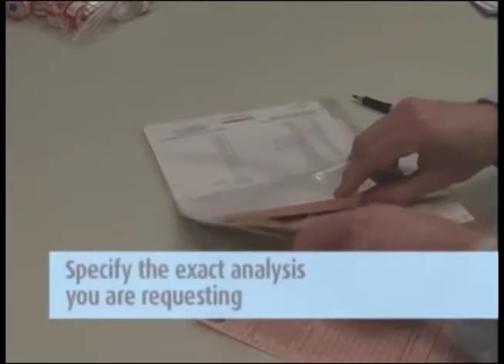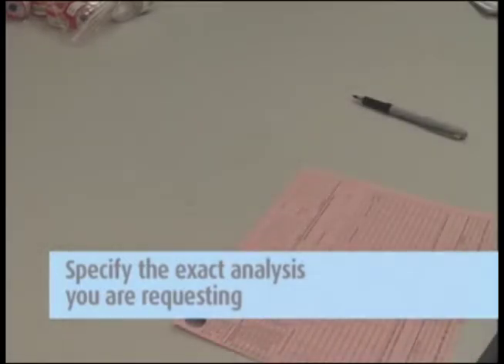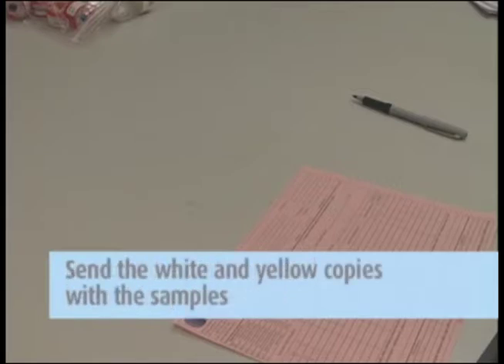It is important that you include all the information requested in order to ensure the turnaround time of your samples. To expedite service, follow the instructions on the bright green label included with your order, specifying the exact analysis you are requesting. Remove the pink copy and keep this for your records. Send the white and yellow copies in with the samples to the lab in the large ziploc bag.